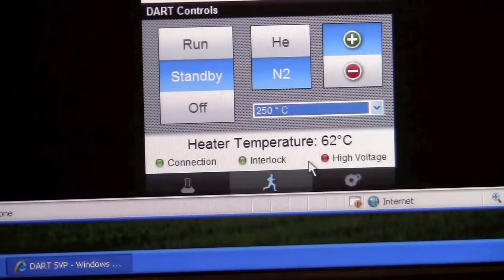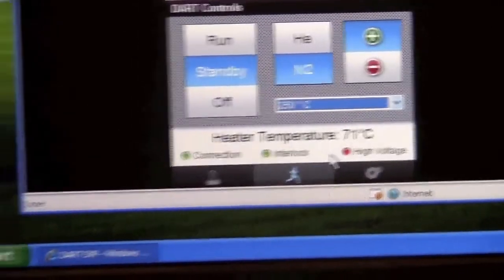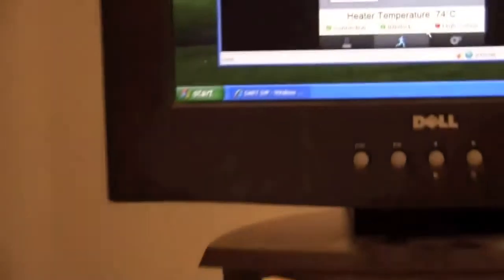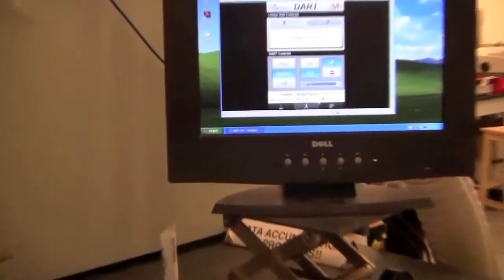While we're waiting for it, we can turn the vacuum pump on. There's a small vacuum pump that draws ions into the mass spectrometer. So down here we can turn on the vacuum pump. We can go back and watch the temperature ramping up.